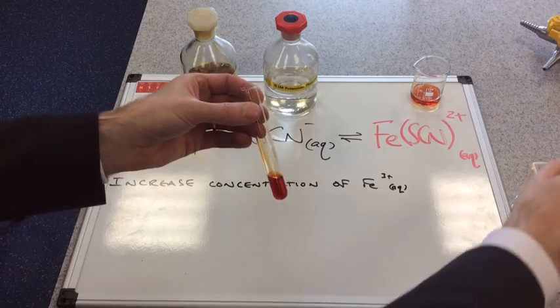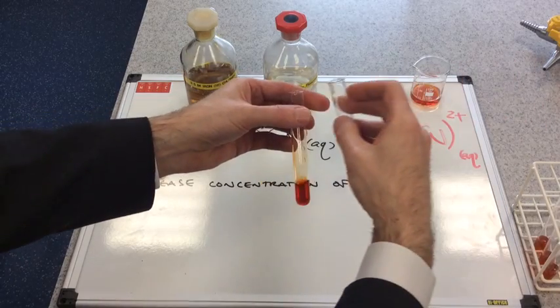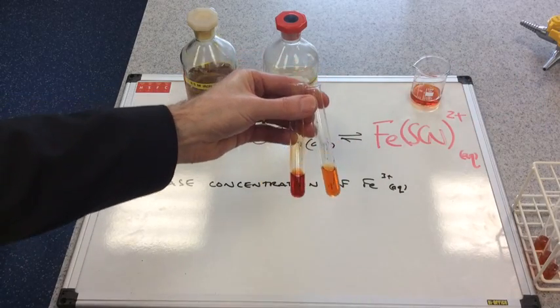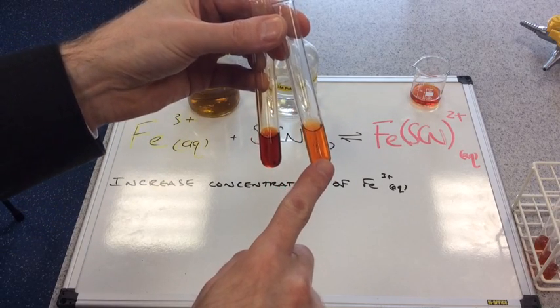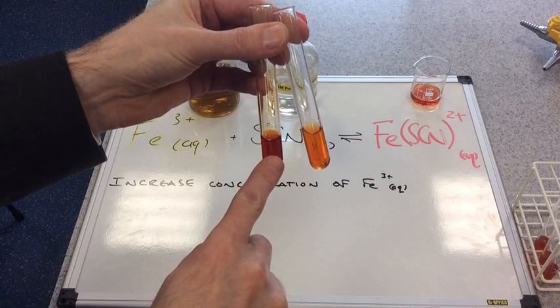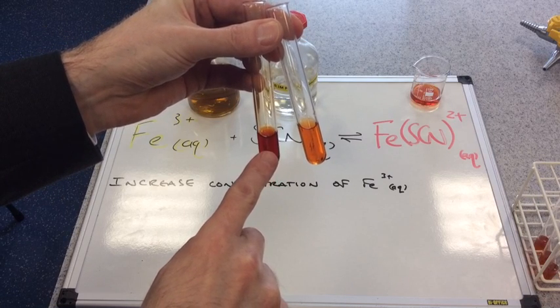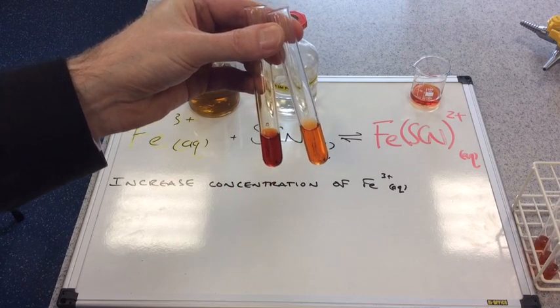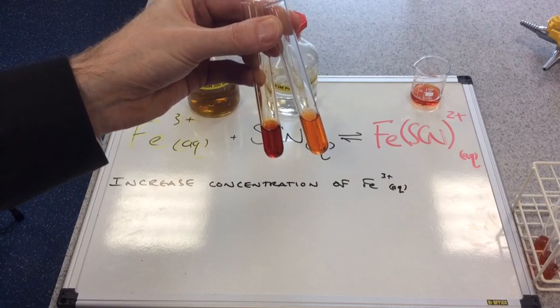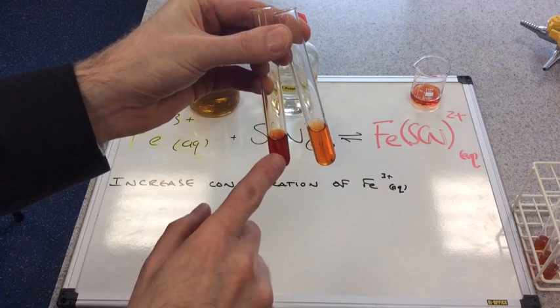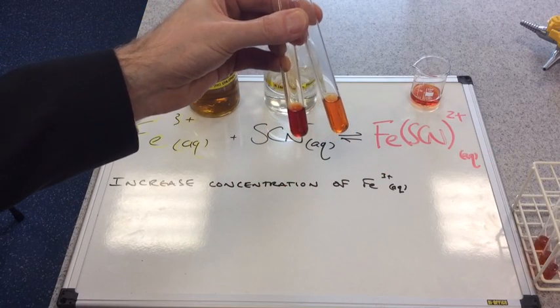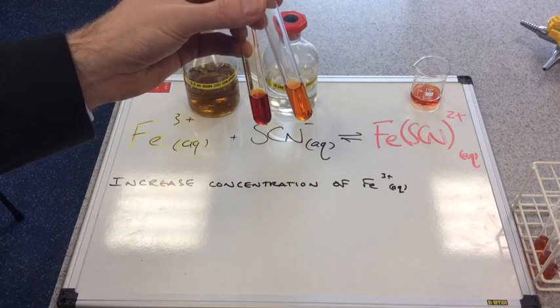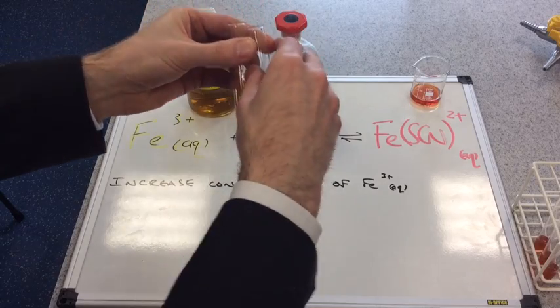If I bring the control tube in now and hold them side by side, hopefully you can see that the control tube is lighter than the tube that's just had the extra drop of iron 3 plus ions in. So you can see this has got darker. The equilibrium must have moved this way to the right to minimize the change.